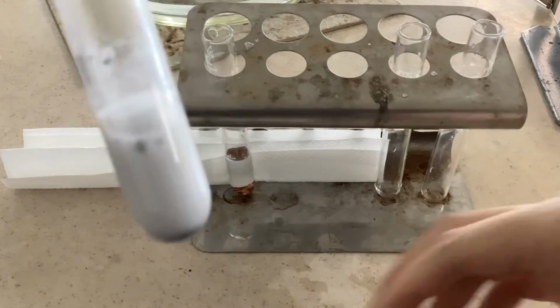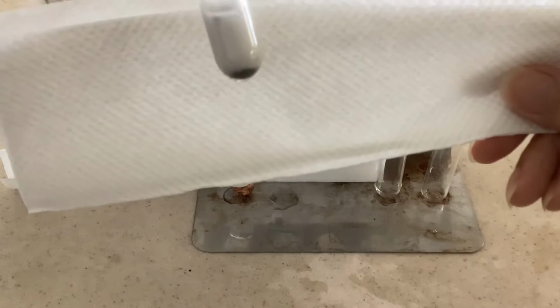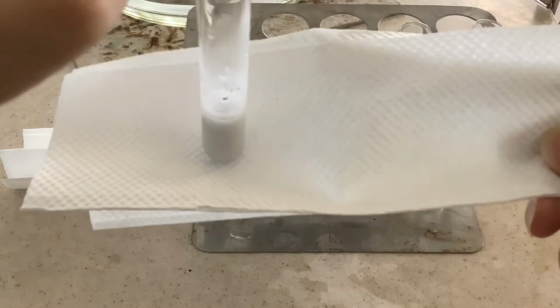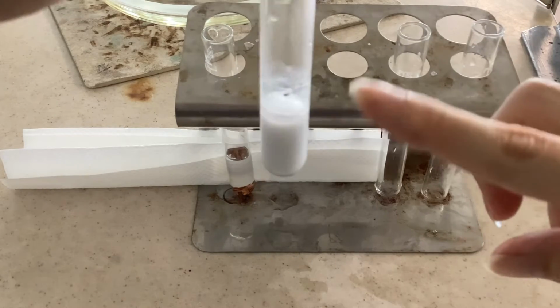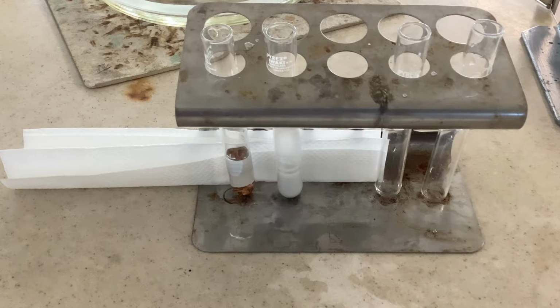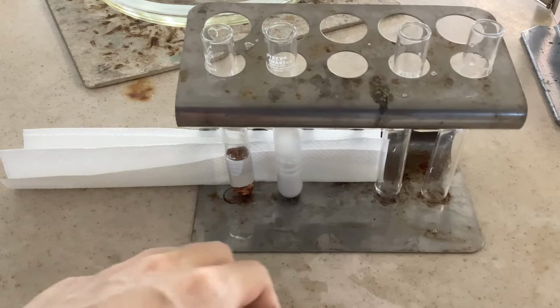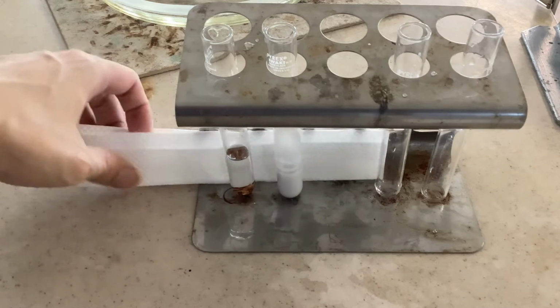Calcium. Here's how it looks. And you can also see some white solid on the test tube inside. And here is part 1, the reaction of water with copper and calcium.